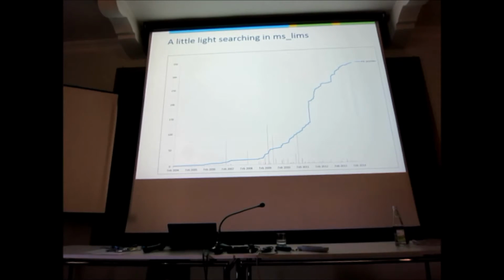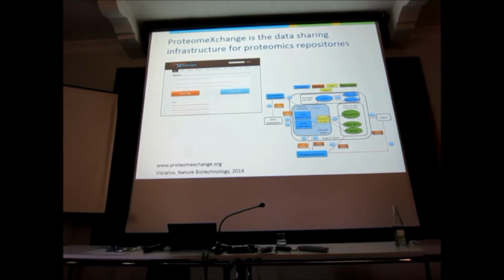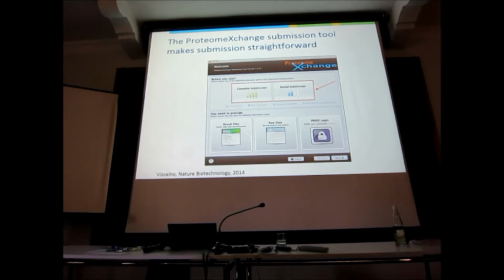And the other thing is that it allows you to take your data and chuck them into a public archive. Which again, it's the big version of what I've just talked about. And these public archives are super useful, right? You can do a lot of stuff with that. And so one of them is Pride, is the one I built at EBI. And it's part of a big consortium called ProteomeXchange that tries to exchange data as broadly and as widely as possible and make life easy for you by making very complicated diagrams. But mostly it has these submit data and access data links, and they have this tool to submit your data.